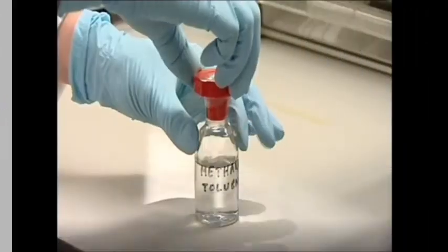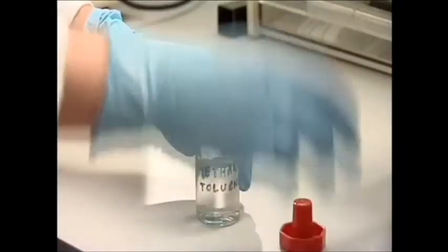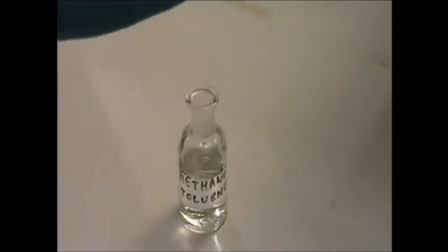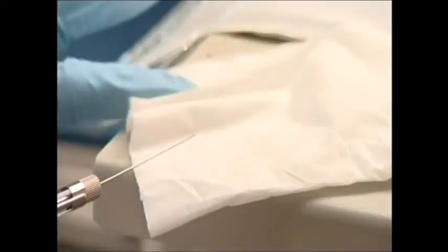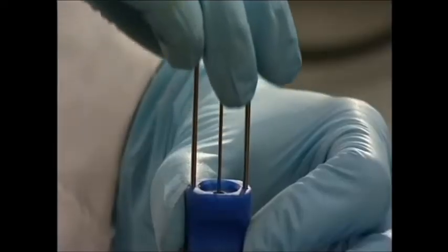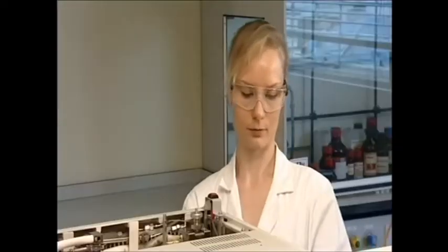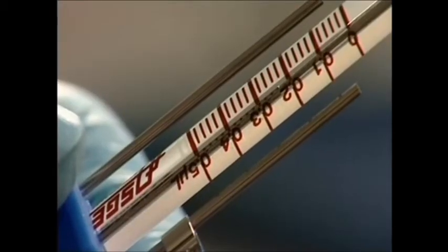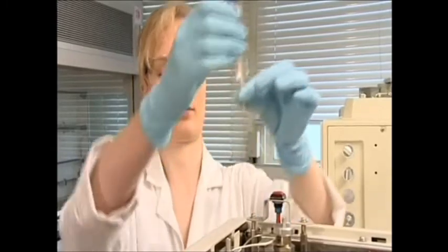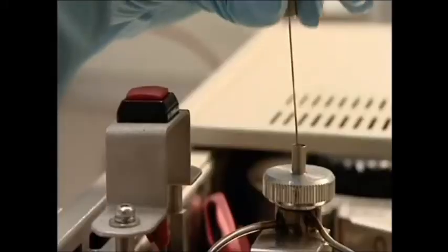Here, we will separate a mixture of methanol and methylbenzene. About 0.1 microliters is taken up in a hypodermic syringe. It is then injected into the inlet port through a self-sealing rubber disc called a septum.